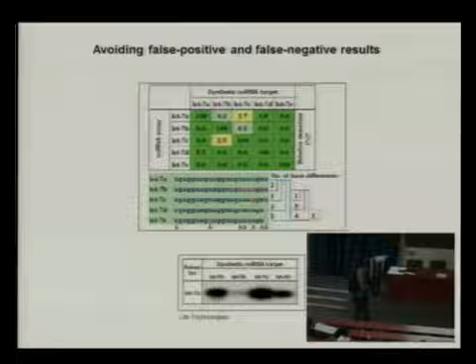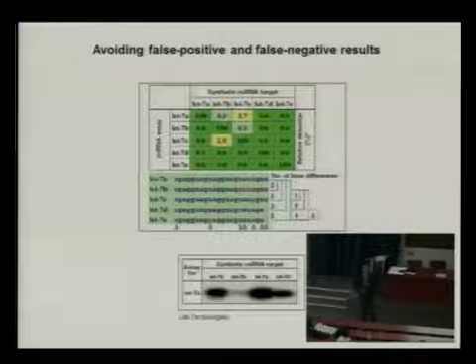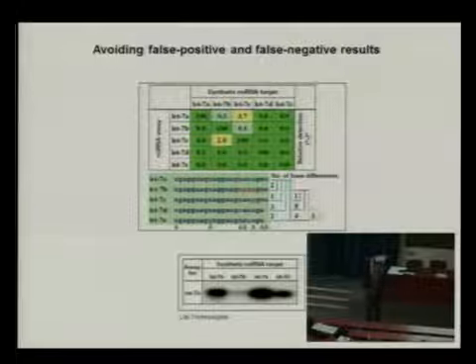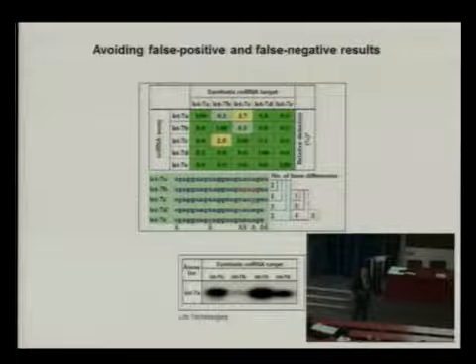And then there's another difference to maybe normal mRNA measurements, and that is that microRNAs can be expressed at a very high level in individual cells. So let me just give you one example. The microRNA 122 is highly expressed in liver cells, and there can be more than 50,000 molecules of this one microRNA in one liver cell. So as Michael also pointed out, you need a very high dynamic range to measure the microRNAs that are of biological relevance.